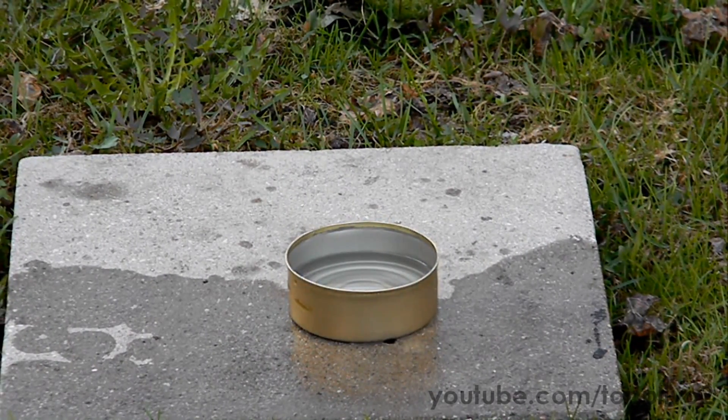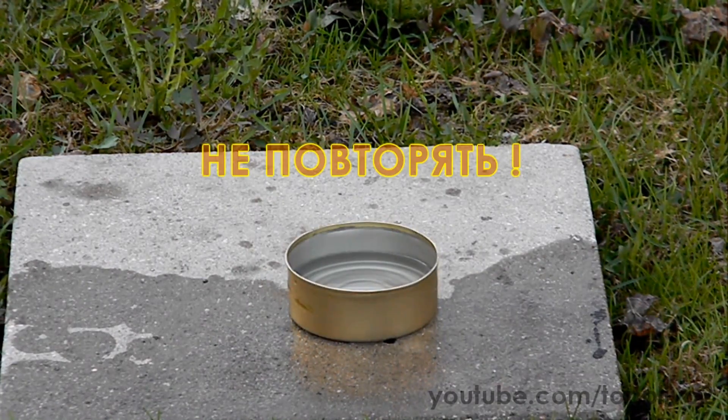Now moving to the reaction of sodium with 30% hydrogen peroxide. This reaction is again very dangerous because sodium ignites and explodes.